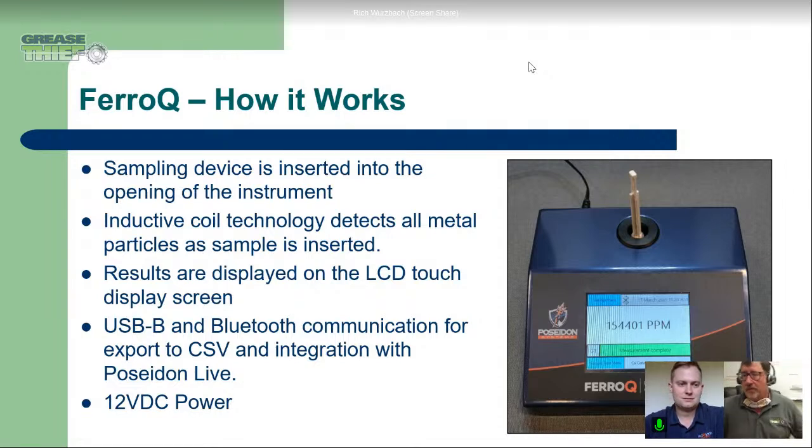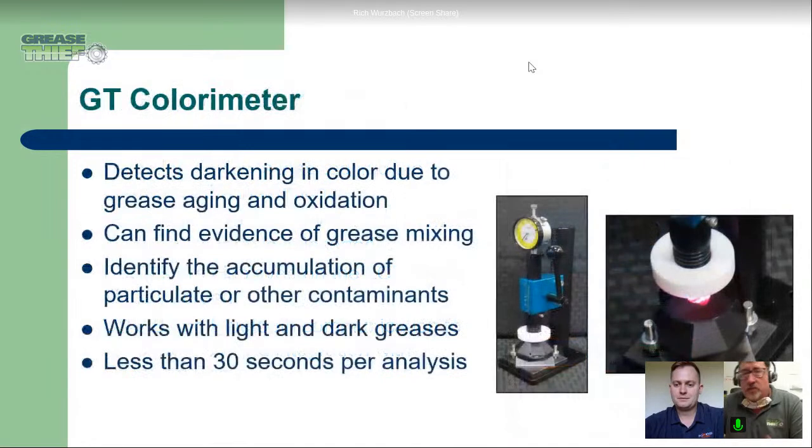Yeah, for sure. That's great. Thanks, Remi. I want to take some time to show some other things too, including the colorimeter, which is the other half of this mini lab solution.